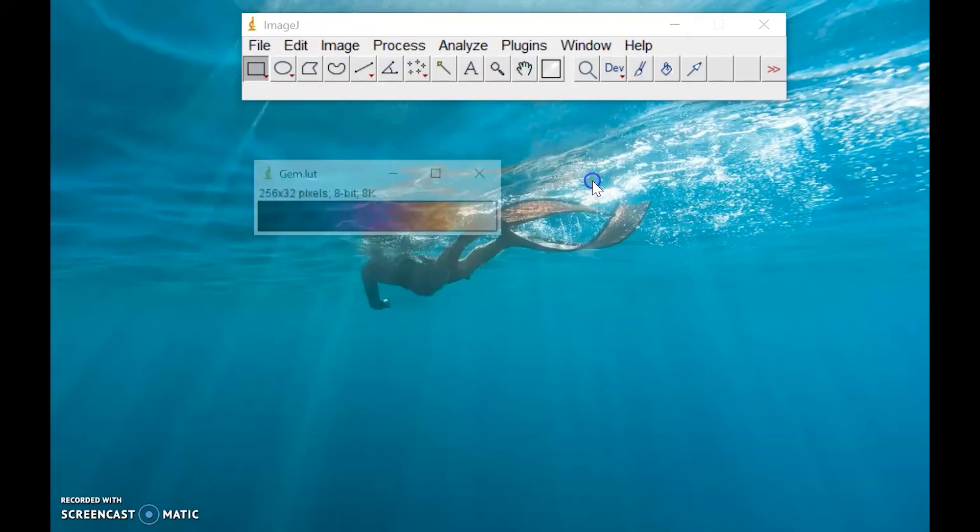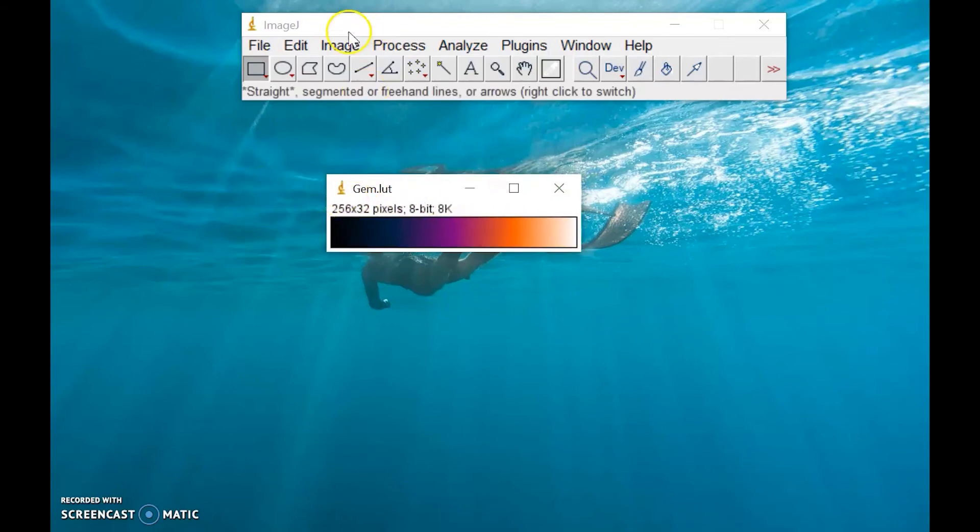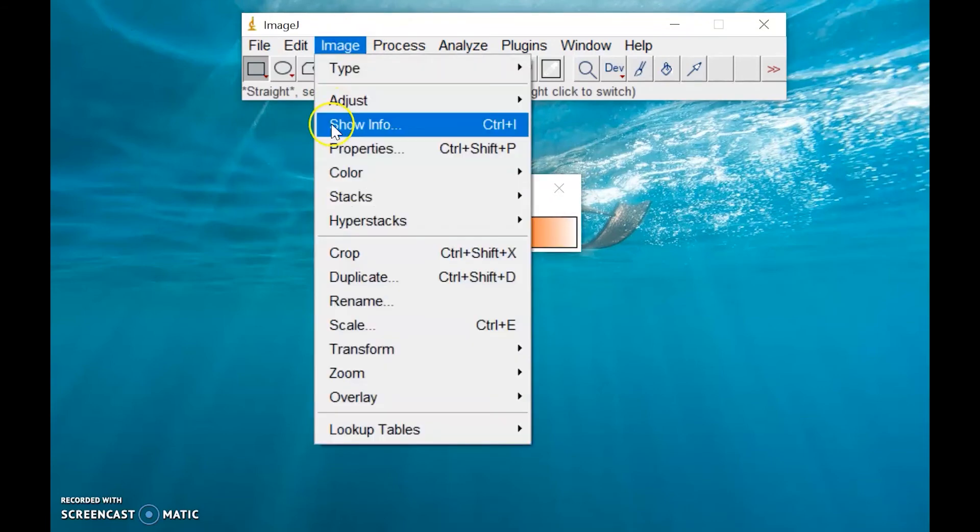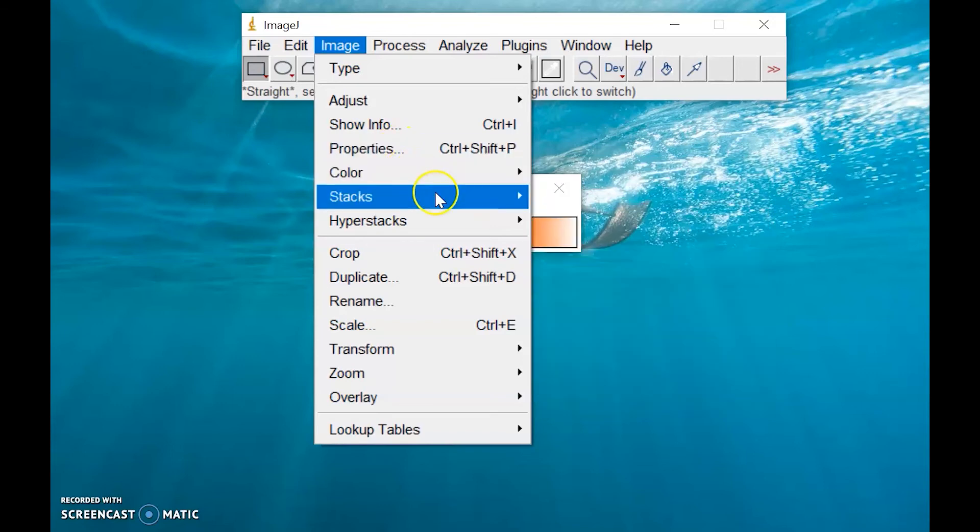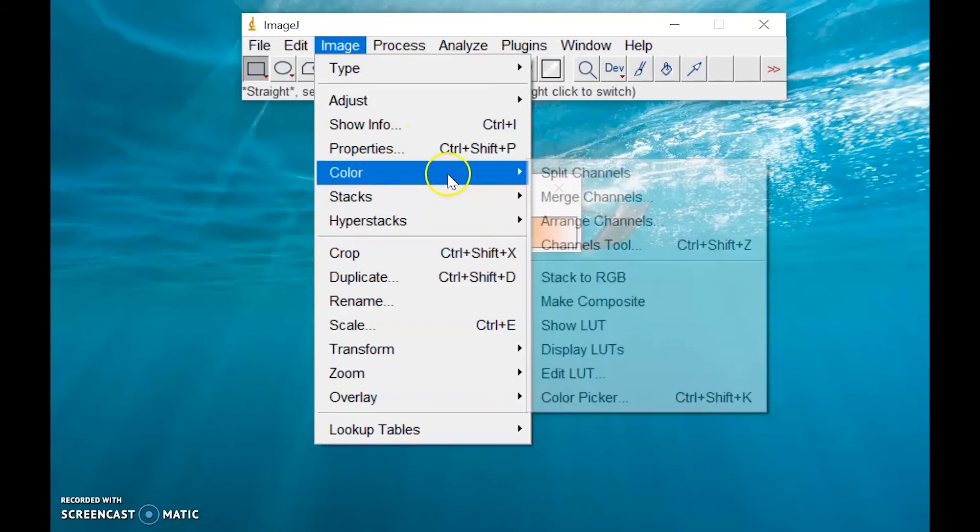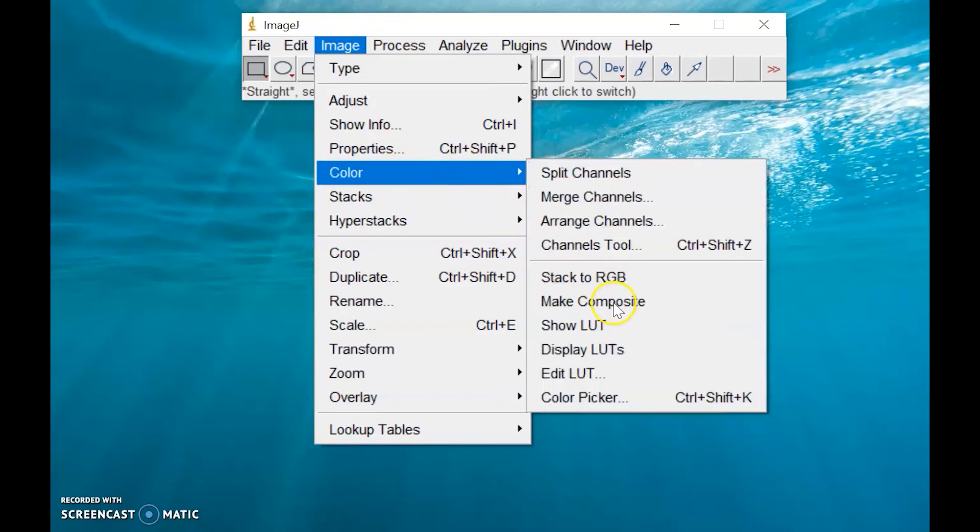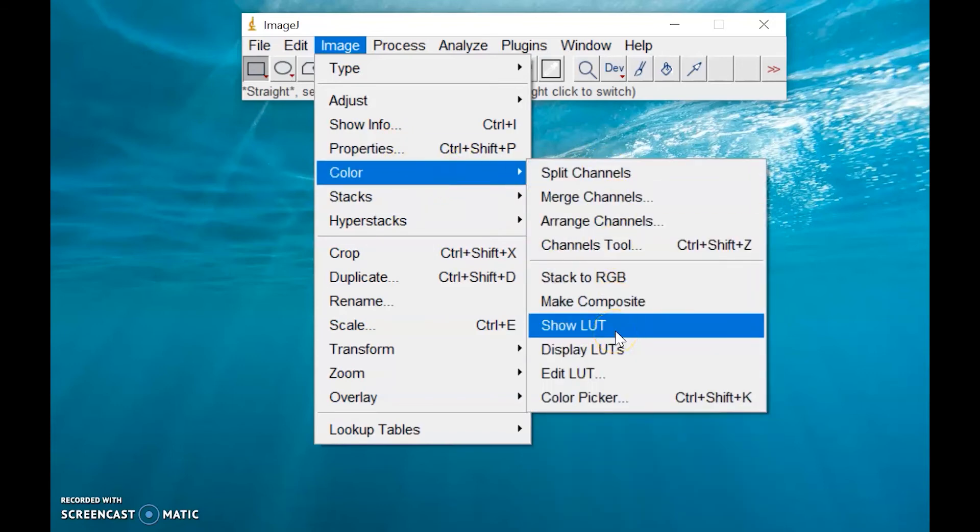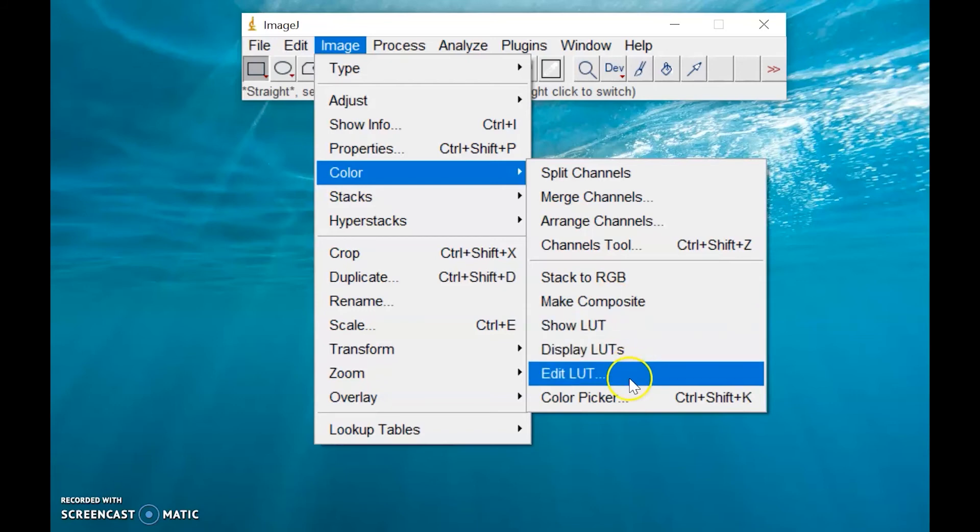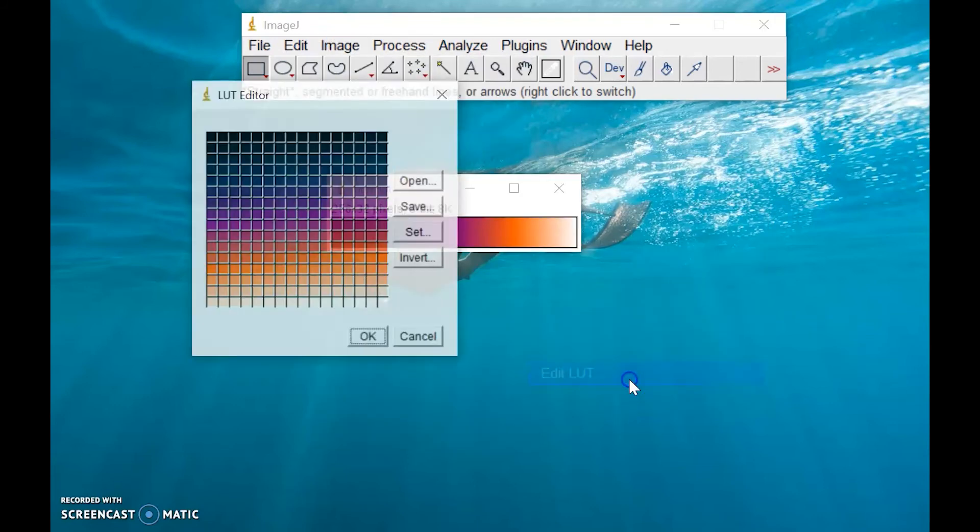any options for the lookup table, and this is our lookup table. Then we have also some options under the color, still under the image menu. You can show the lookup table that you're currently using, display that lookup table, or you can also edit that lookup table.